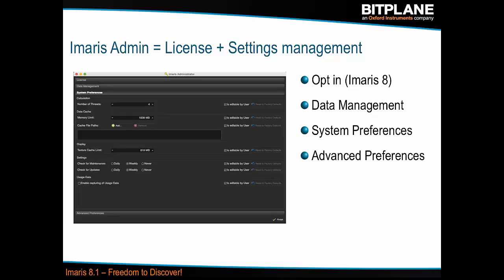So you should see fewer technical issues due to users changing things that they probably shouldn't have been touching. So this is the Imaris Admin, which includes settings and licenses. And in principle, this should give you more control and more freedom to control all these settings.